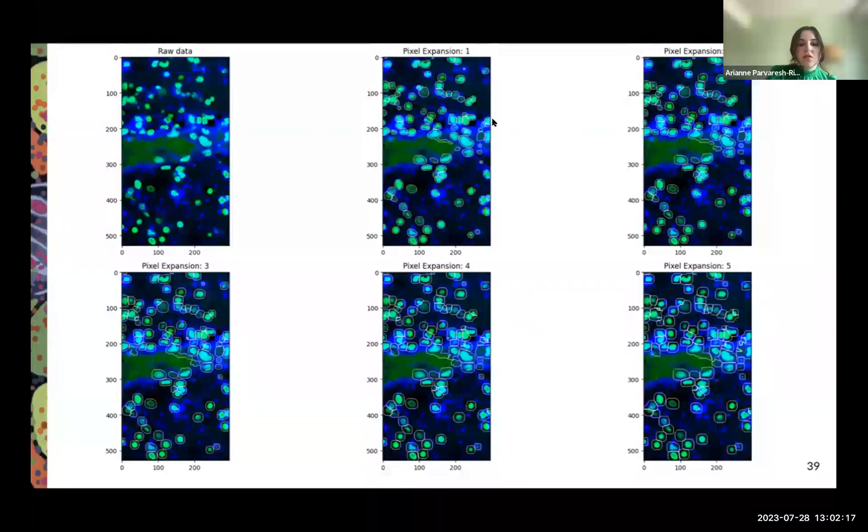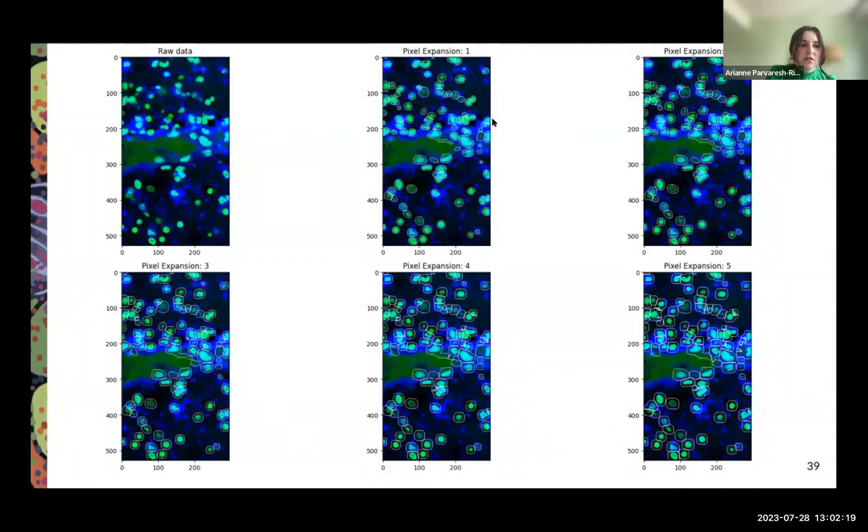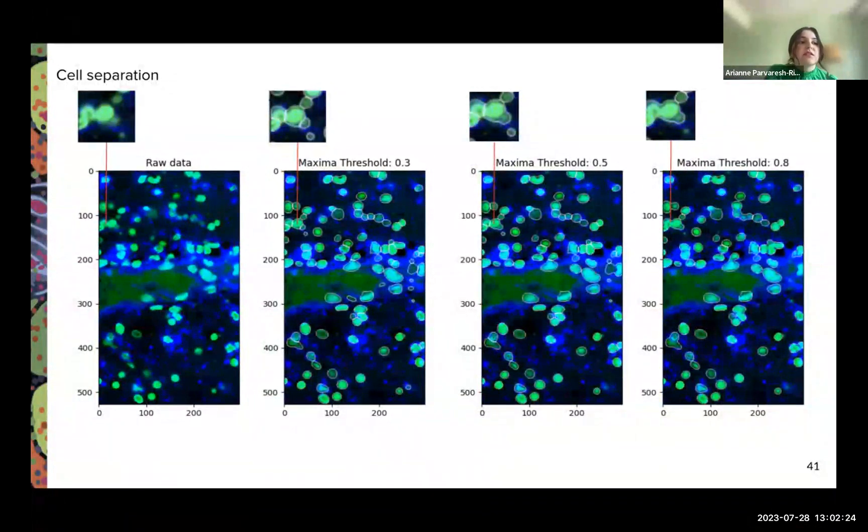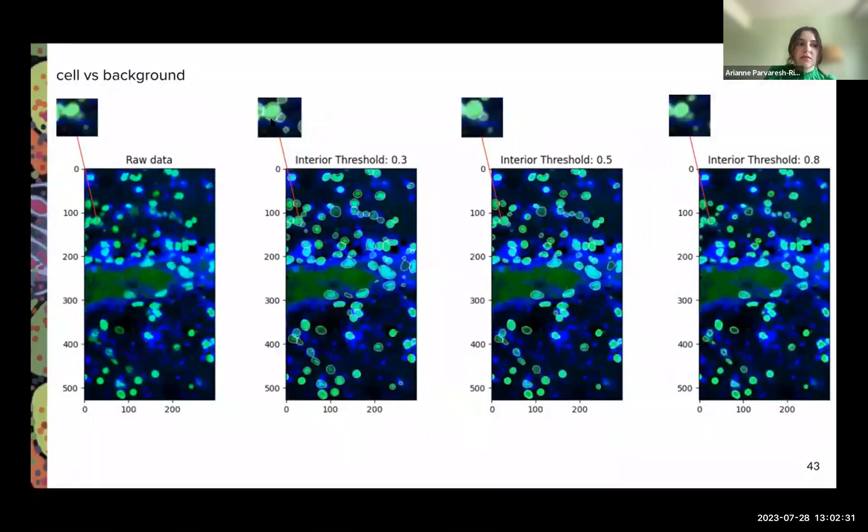Same with the third sample. With pixel expansion, as the value is increased, more cytoplasm is captured. With the interior threshold value, the lower the value, the more cells are separated. Interior threshold, more conservative detection.